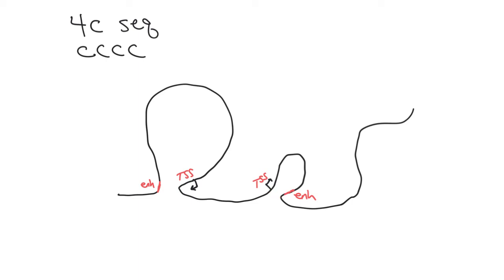So this is similar to a technique that we've looked at before, ChIP-seq, where at a particular point in time, the DNA and the histones are cross-linked with something like formaldehyde. And then what happens is the chromosomes are broken randomly, and those pieces of DNA then are ligated together.